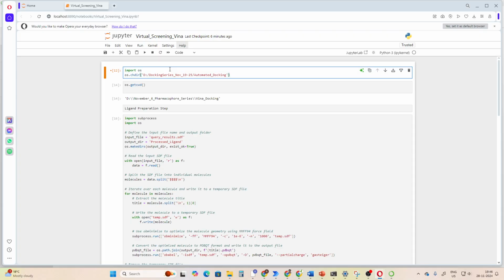When you want to execute the command that you have written, you press the enter button, the same thing. So you can just press this play button, then it will execute the command. It's already executed, so nothing is showing. That means it is successfully executed. Otherwise, if there are errors, it will show the error here.